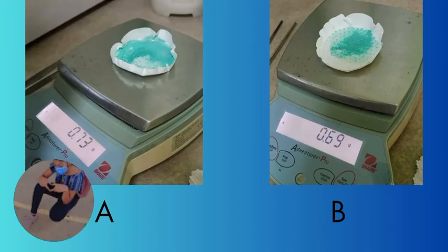So for the girls' percentage yield of 115%, it might have occurred because of product not fully dried, filter paper residue, or contaminants like sodium chloride and sodium carbonate trapped in the precipitate.